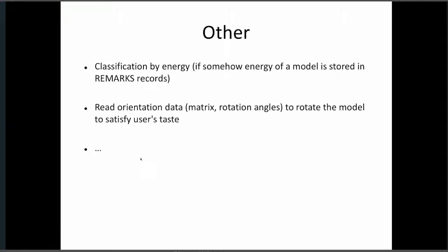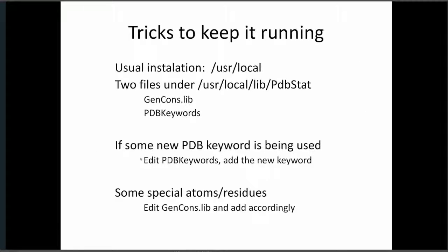And I did that also. I mean, it's a lot of features that maybe are not well documented. I am trying to document all that stuff better. And we are reaching the end of the talk. There are some tricks to keep it running that people are always asking me about.